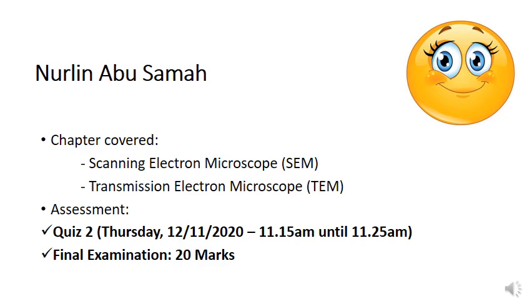Okay, so I'll be teaching you about scanning electron microscope, SEM, and also transmission electron microscope, TEM. For this topic, you will be taking quiz 2 on this Thursday, 12 November, at 11:15 a.m. until 11:25 a.m. So please make sure you can be there on time. And for the final examination, this topic will cover about 20 marks.